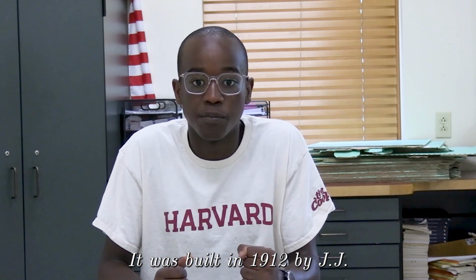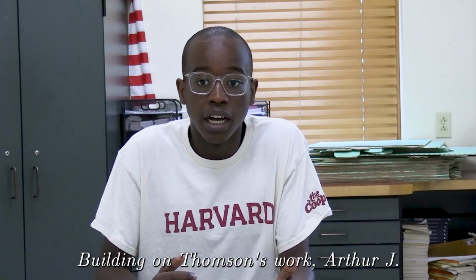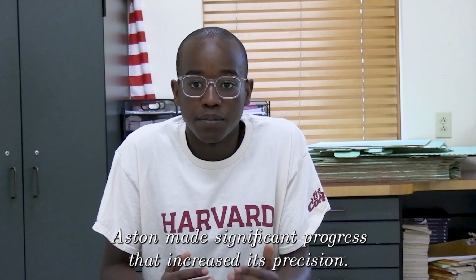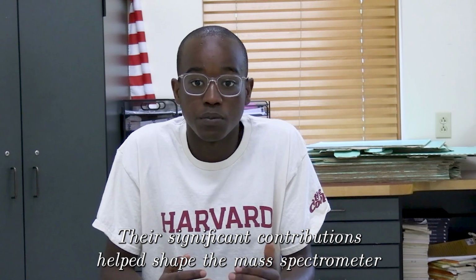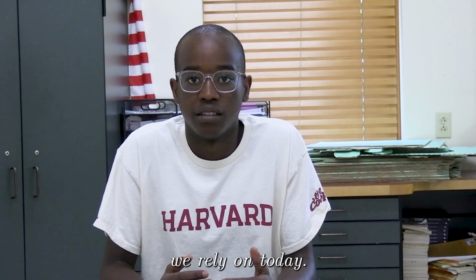It was built in 1912 by J.J. Thomson while studying the isotopes of neon. Building on Thomson's work, Arthur Jeffrey Dempster and Francis W. Aston made significant progress that increased its precision. Their significant contributions helped shape the mass spectrometer we rely on today.